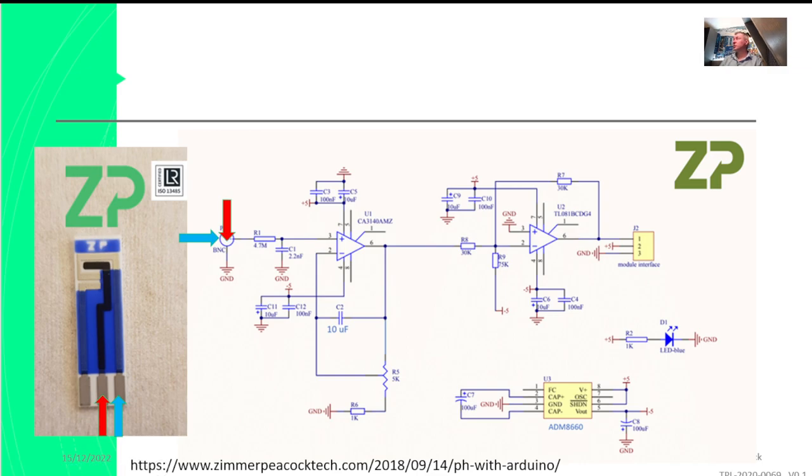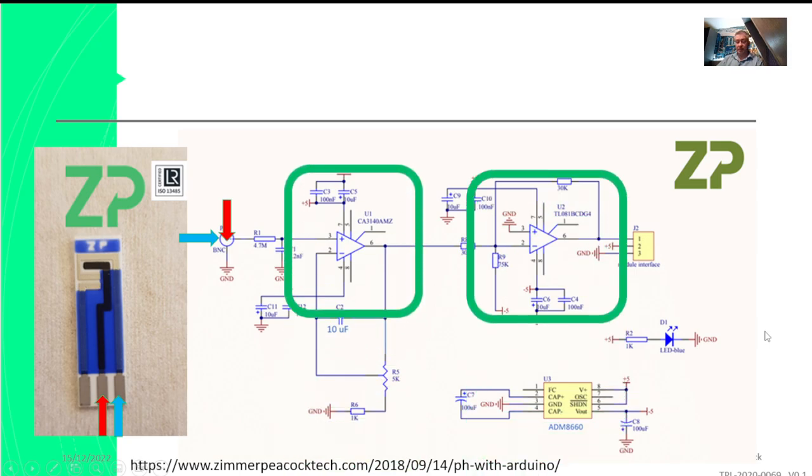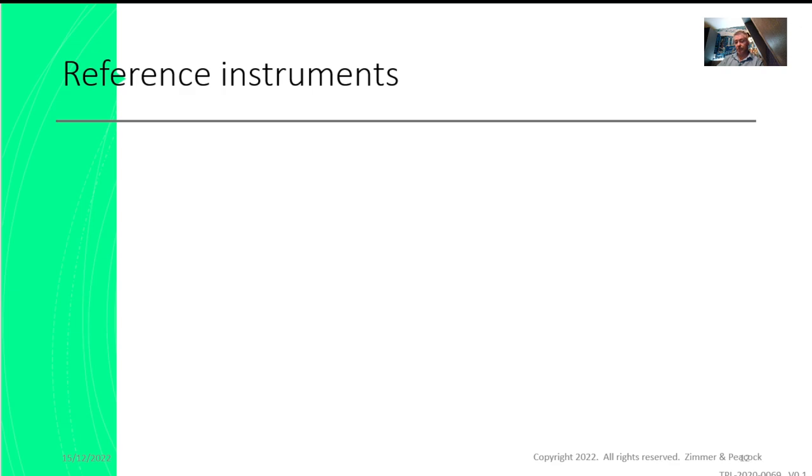Now, we do not support this webpage anymore. We leave it up there to help the community, but it's not something that we absolutely support. But it had some elements that you have, and we were a bit concerned about what's happening on your reference electrode.